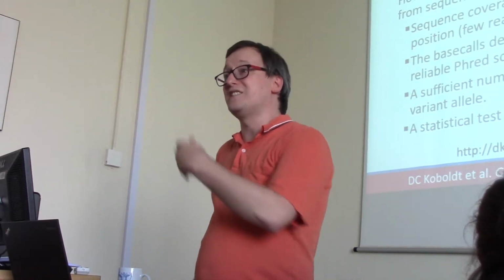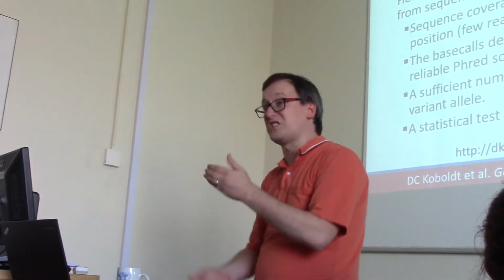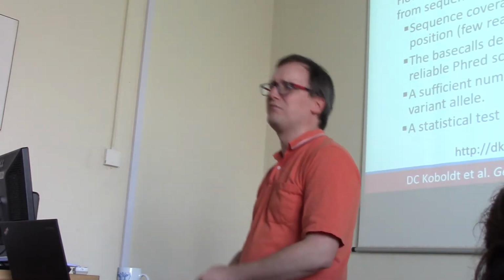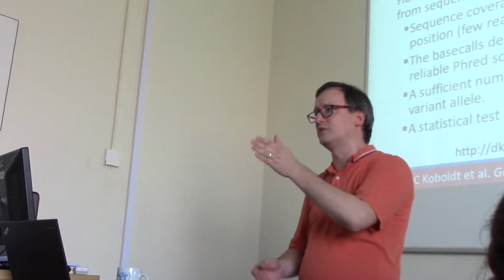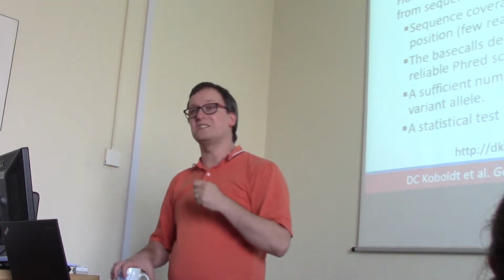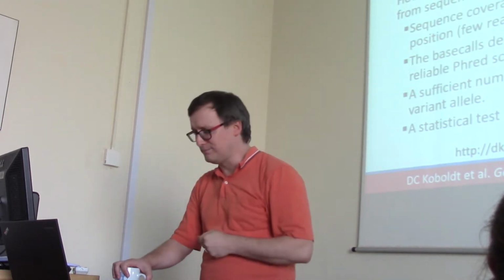Well, you're going to have to depend on some other points of evaluation, because having just 2 reads at that location isn't particularly good. Ideally, you'd have 50 reads that span this location, all of which agree that there's a difference here. So we want to see more reads to reduce our error of calling a variant.